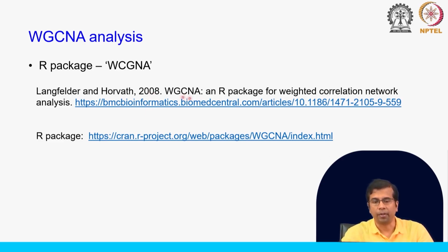Okay. So, this is the paper that actually describes this R package, right, and it kind of stepwise mentions what the process will be for doing this WGCNA analysis and what we need to do at each step. Here is the R package. We will have a look at this R package and its manual, and then of course we will apply this package for our hands-on analysis.